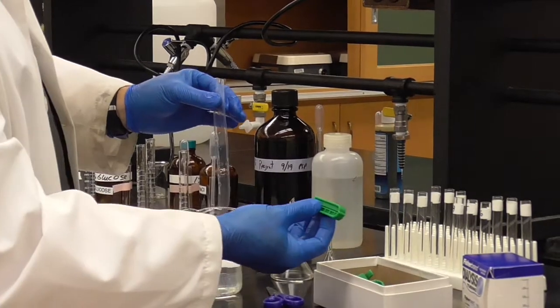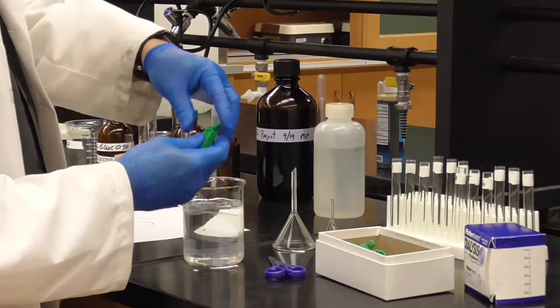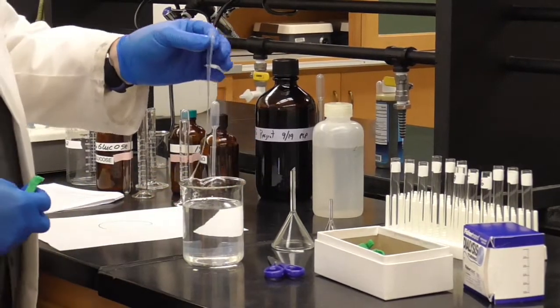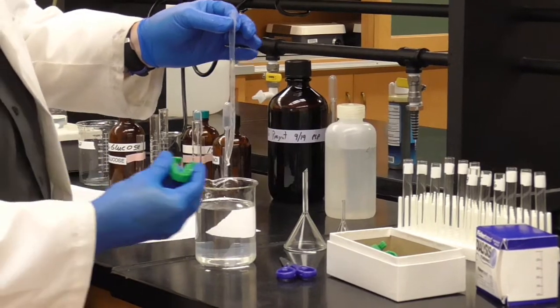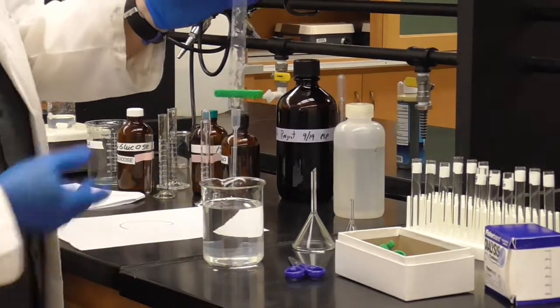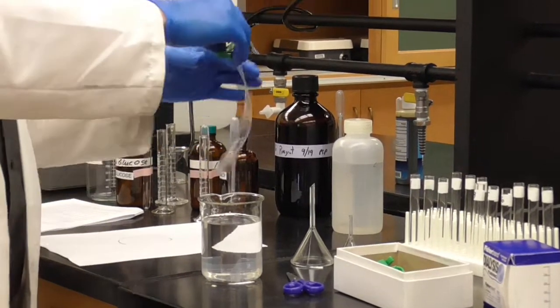Here are our actual clips. They just open right up. I'm going to put this down actually and show you. They just open up, and so to seal off the ends of the tube, you simply put one across the bottom and snap it in place like that. And so now the bottom of the tube is sealed. You can do the same thing with the top of the tube.